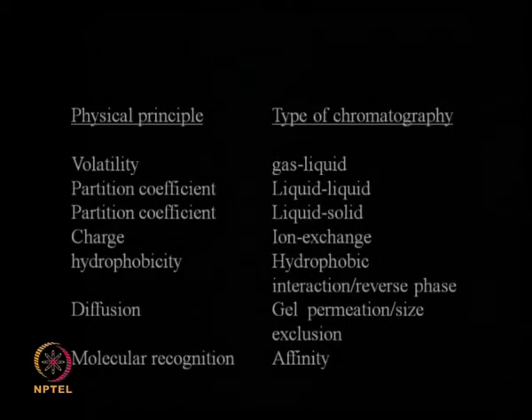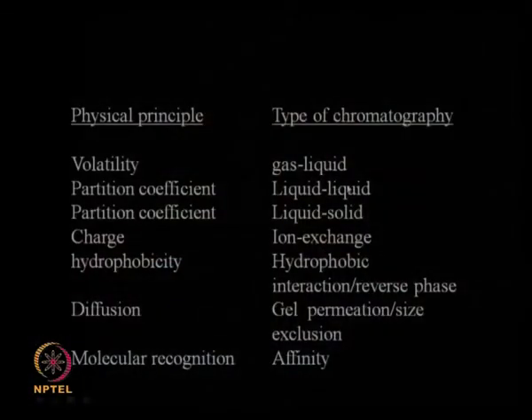So what are the physical principles? If it is based on volatility, then you have something called gas liquid chromatography, or GLC. If it is based on partition coefficient, that means the solute partitions between the liquid in the continuous phase and the liquid that is immobilized, then we call it liquid liquid chromatography. If it is again based on partition coefficient, you may have liquid solid chromatography. The forces on the solid could be ionic forces, hydrophobic forces, or electrostatic forces.